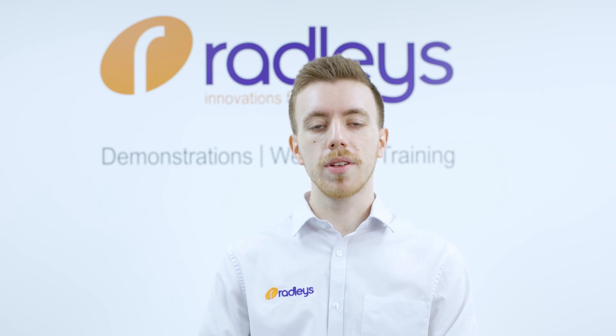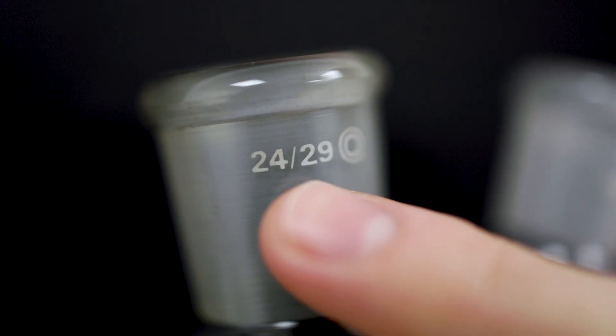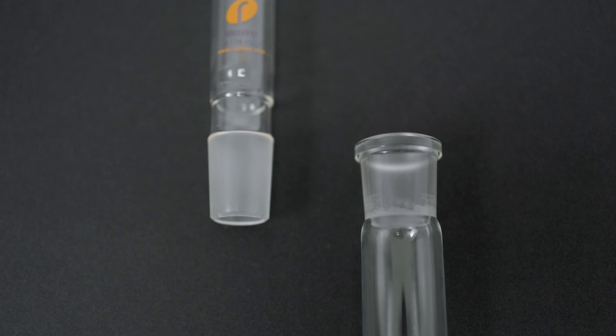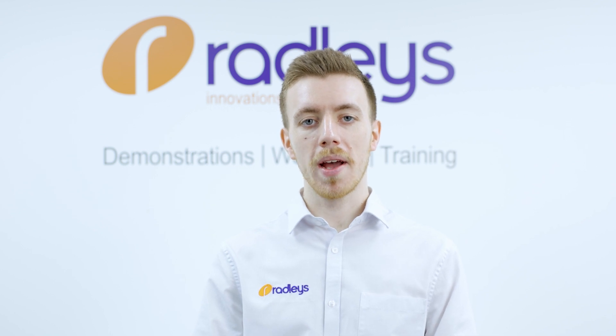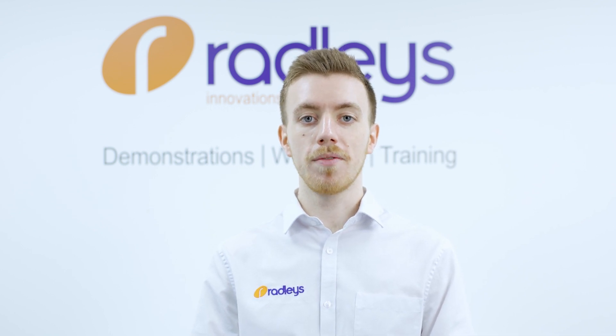When looking at ground glass joints, you will have noticed measurements such as 24/29. The first number represents the outer diameter in millimeters at the widest point of the male joint. The second number represents the length of the ground glass joint in millimeters. This means that if the first numbers of a male and female joint are not the same, then they won't fit together.